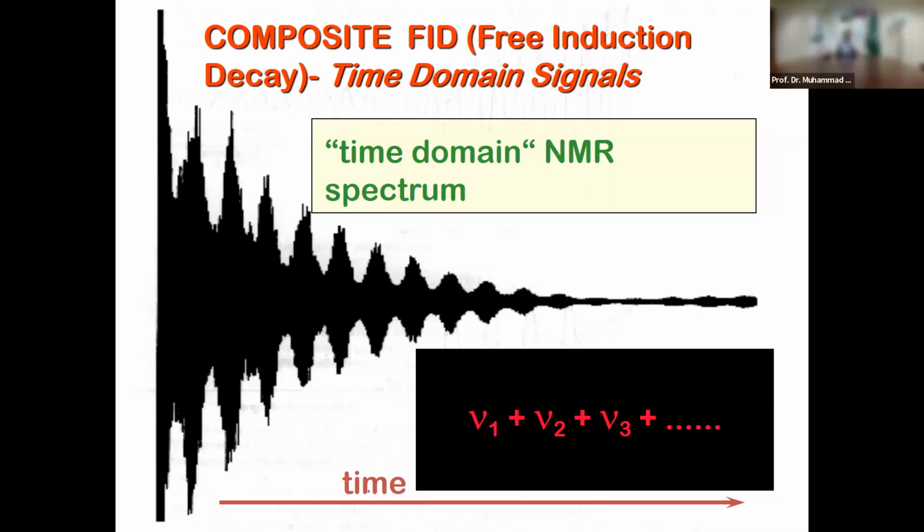The other is called spin-spin relaxation, and that is just an energy transfer from one proton to the other in the case of proton NMR spectrum. It just dephases the signal, but it is not really an effective mechanism of relaxation or losing the energy. So actually what we are interested in is T1 relaxation, and as I'm going to tell you in the subsequent experiment, how T1 is calculated.